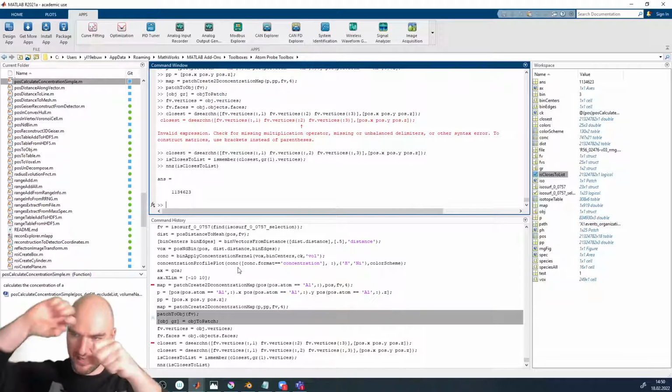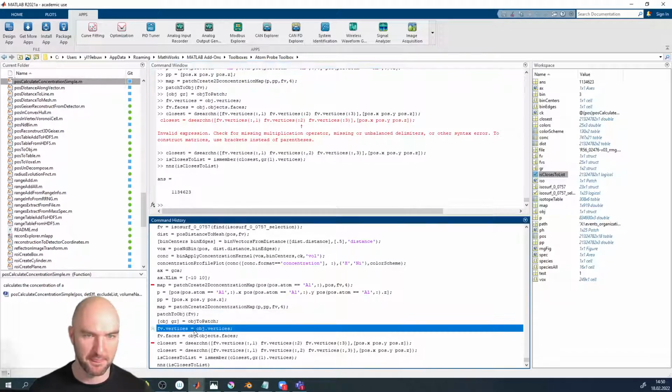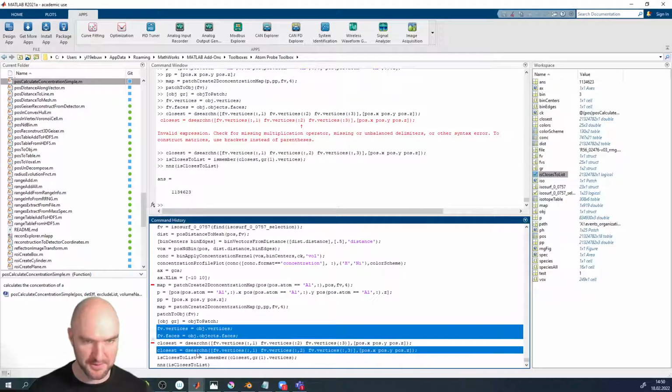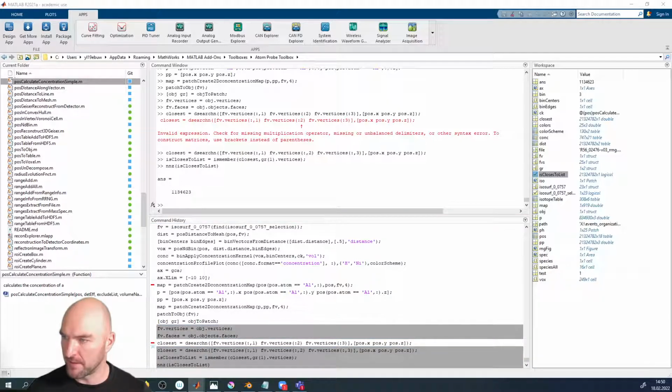And this is kind of like putting an analysis cylinder perfectly spot on onto those vertices. I mean, you can do that manually. You can put an analysis cylinder there, but it's essentially doing that. And you can see it's just a couple of commands, so it's not a lot of work, but that should have been merged in, and I apologize for that.